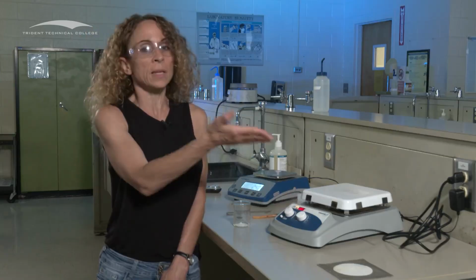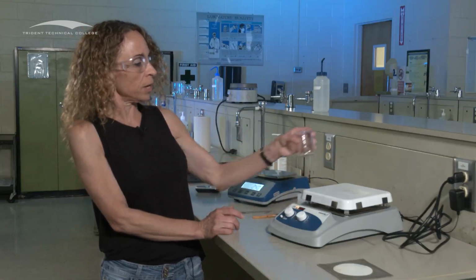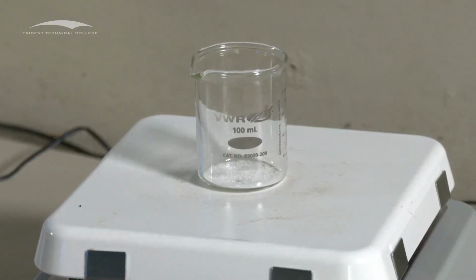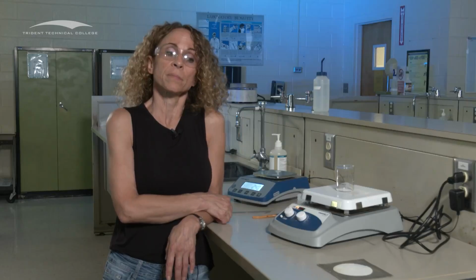Okay, so it takes a little bit of time for it to reach that point. But let's just pretend like now it's hot. Yours is hot. You're going to take your beaker with your solid and put it directly onto the hot plate. You're going to let it stay there for however long is specified in the procedures, 10 or 15 minutes. And then you're going to remove the beaker off the hot plate.